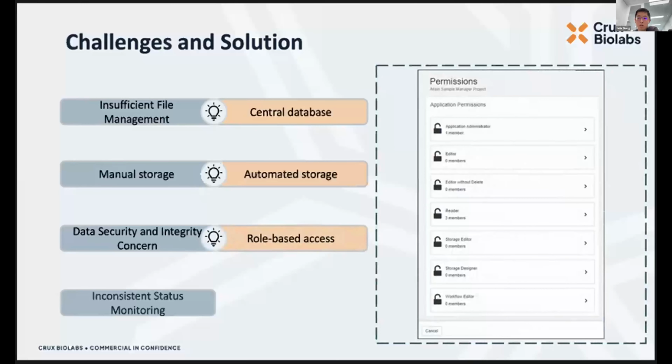Thirdly, LabKey allows us to set different access levels for each department, so we can control what permission each team has regarding the samples. So for example, as part of the sample management team, I have the editor access for both samples and storage. So I can add, update, or delete the samples, as well as manage the storage unit and the box layouts.